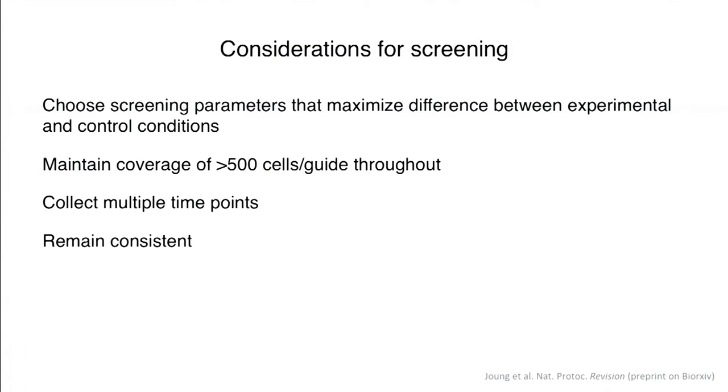And then it's also important to remain very consistent throughout the screen, because if you change any small thing, like you somehow switch media in the middle of your screen, you don't know if at the end of your screen the difference that you see is due to the media change or something from the screen. So you might get some false positives from that.